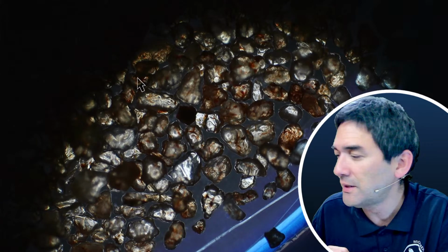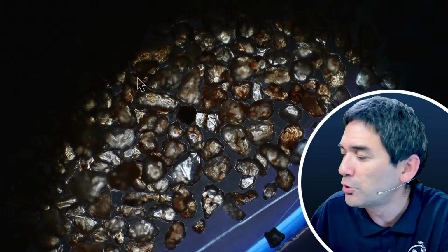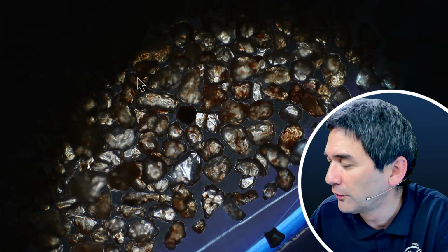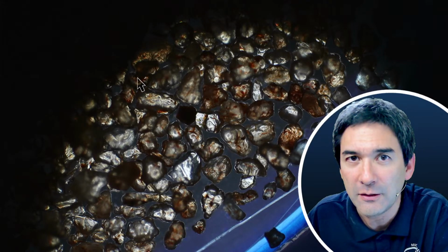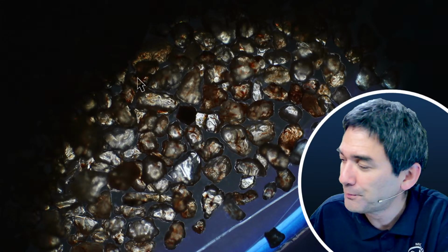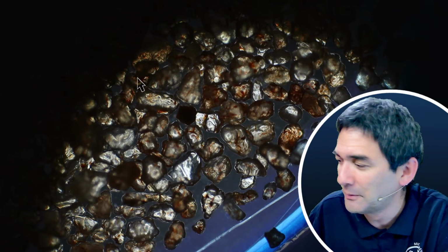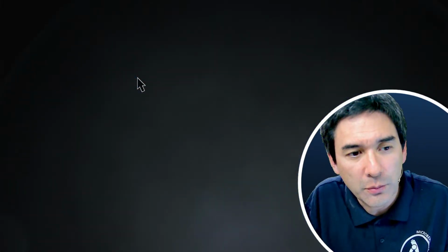I only have dark field using the 4x microscope objective. For those of you a little bit more into the technology here, why only for that? Because this is actually not a dark field patch stop, but it's actually the annulus ring for phase contrast, for the 40x, but it works also for dark field. So that's a little bit of the technical background here. Okay, but as I said before, I probably like the stereo microscope view better.